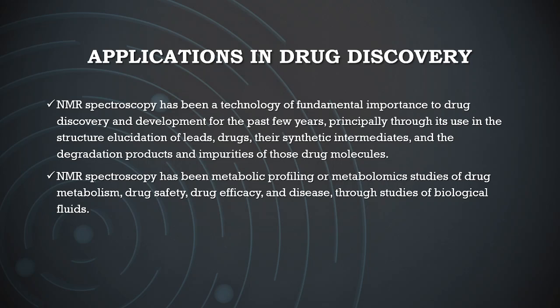NMR spectroscopy has been used for metabolic profiling or metabolomic studies of drug metabolism, drug safety, drug efficacy, and diseases, through studies of biological fluids such as urine and plasma, representing the change in applications from the chemical to the biological sciences.